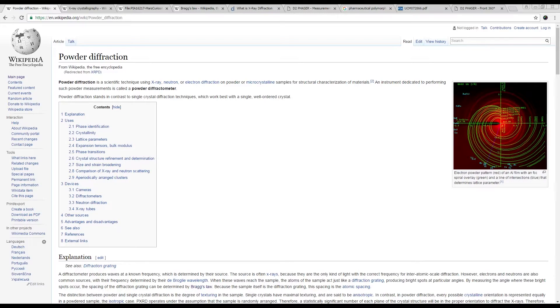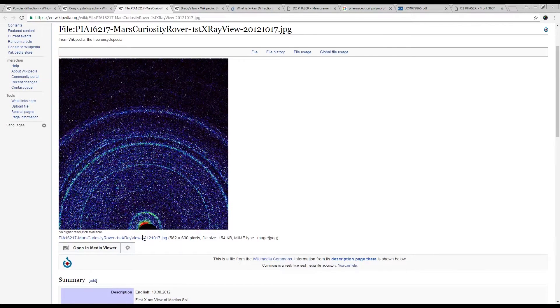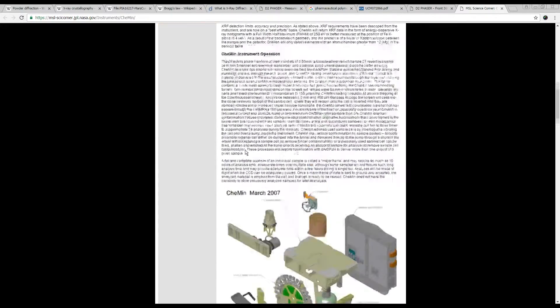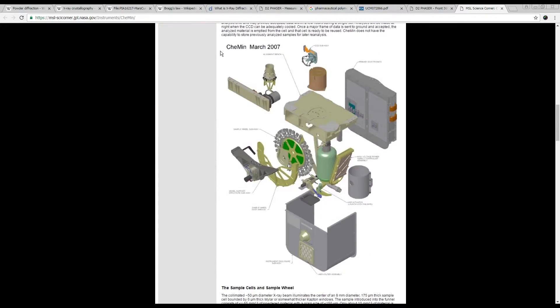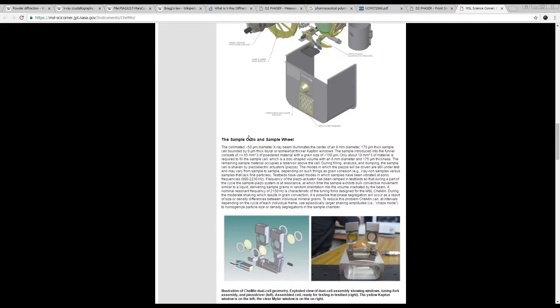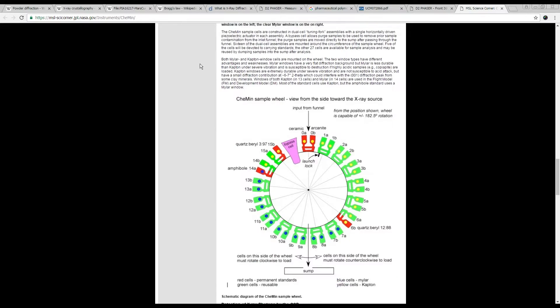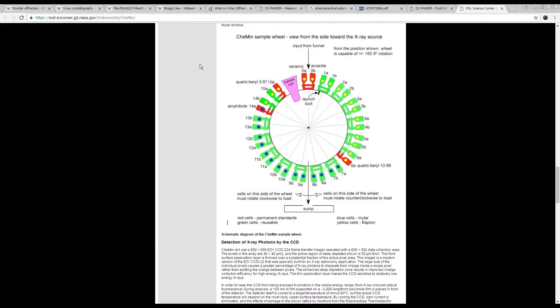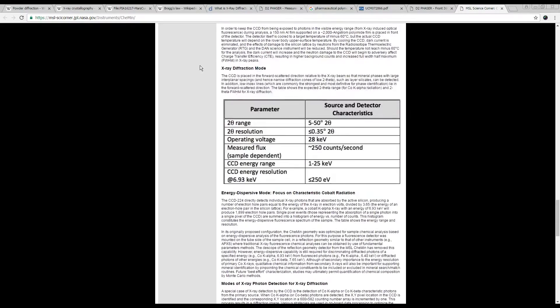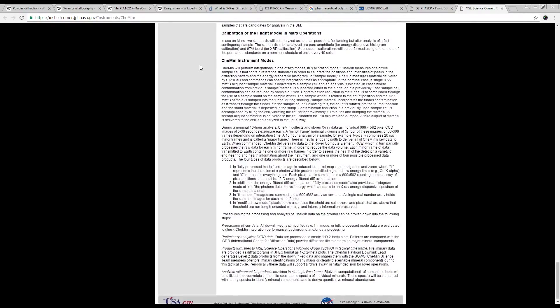X-ray powder diffraction is a very useful technique for determining physical characteristics of material, as well as pattern matching identification, and it's been used everywhere. It's used for materials science, it's been used even on the Mars Curiosity rover. They have a very small x-ray powder diffractometer for telling what different crystal phases of minerals are on Mars, because we have a very extensive understanding of what the different structures of crystals should be, and by way of x-ray powder diffraction, we can actually see what is on Mars.